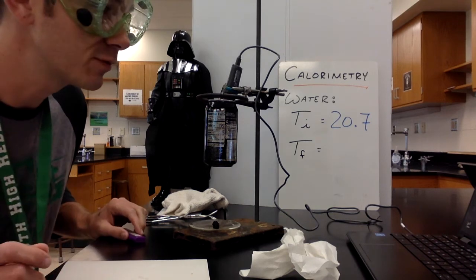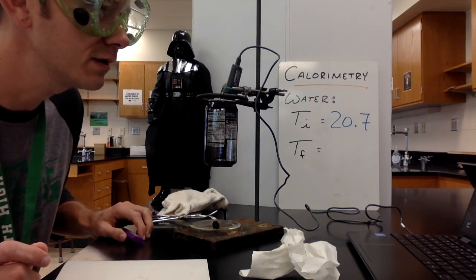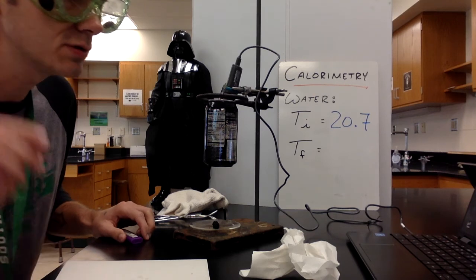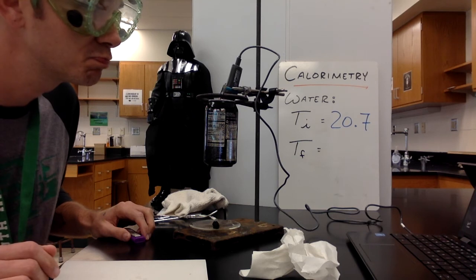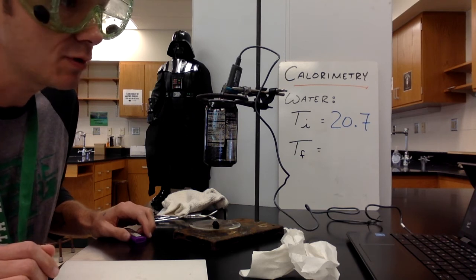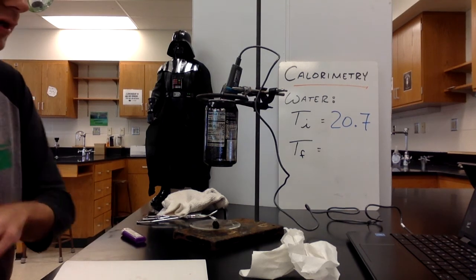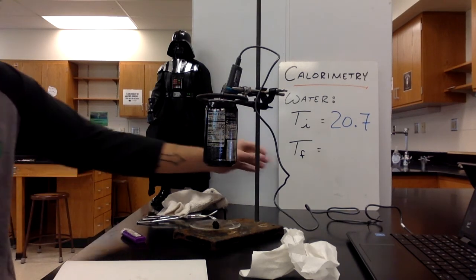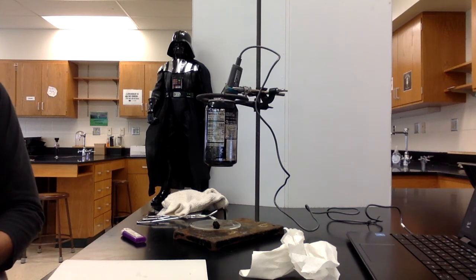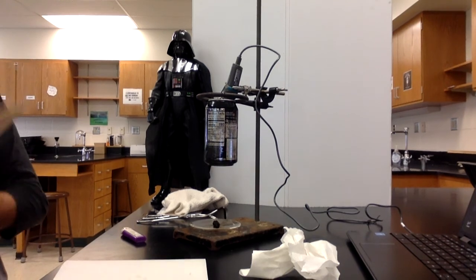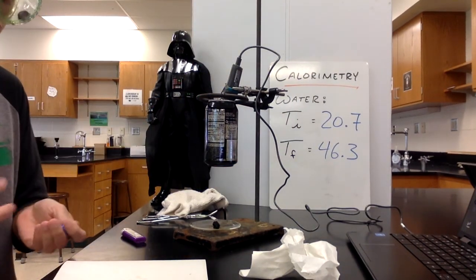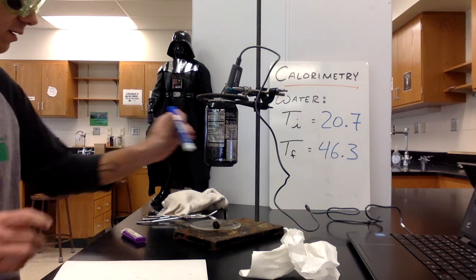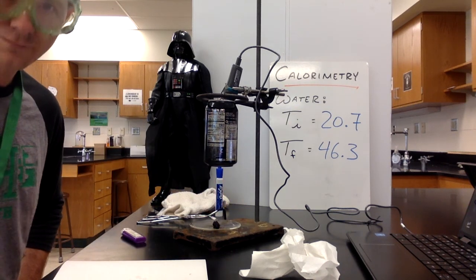Let's go ahead and read the final temperature. Still just slightly climbing just a tad. One second. Looks to be holding steady now at 46.3 degrees Celsius. So 46.3 degrees Celsius for our final water temperature. Let's go look at that data, guys, and get crunchy.